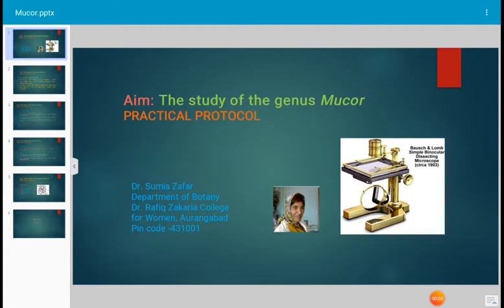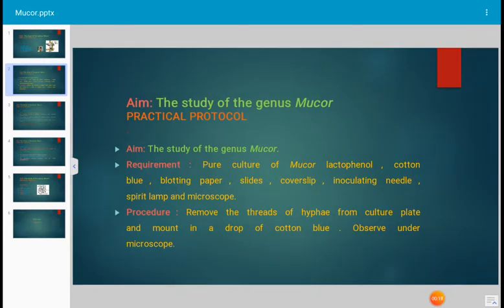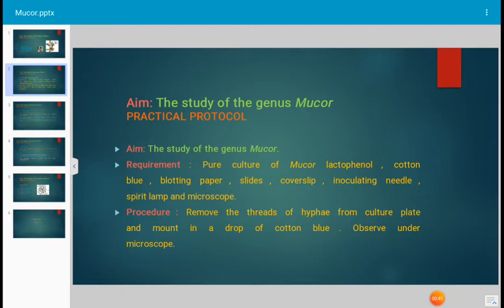Today's topic for discussion is a practical protocol of mycology, and today's practical is the study of the genus Mucor. Mucor is a saprophytic fungus very commonly occurring in laboratories and everywhere. For the practical purpose, we need a pure culture of Mucor, lactophenol cotton blue, blotting paper, slides, cover slips, inoculating needles, spirit lamp, and microscope.